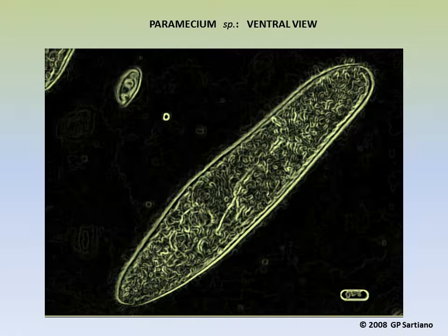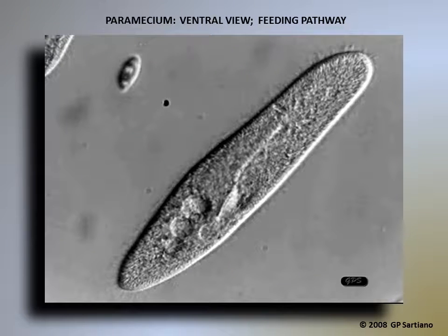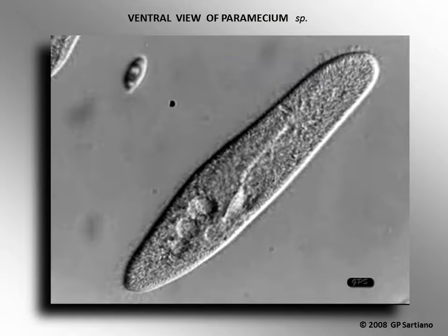Paramecium, ventral view. The organism is approximately 180 microns in length.